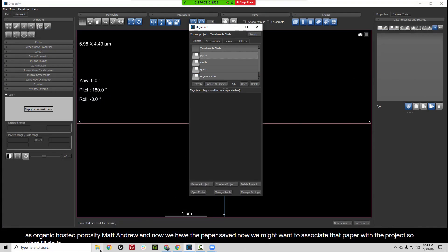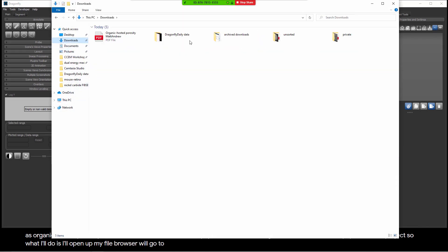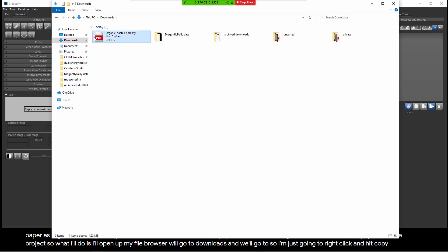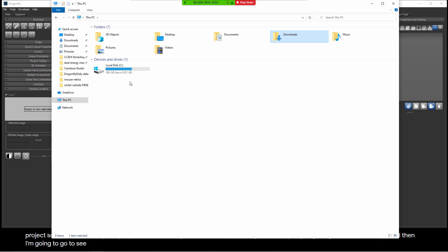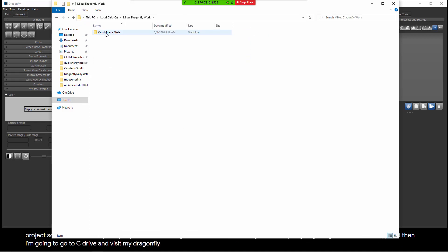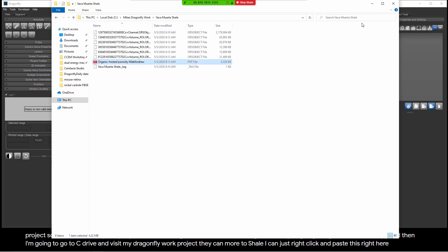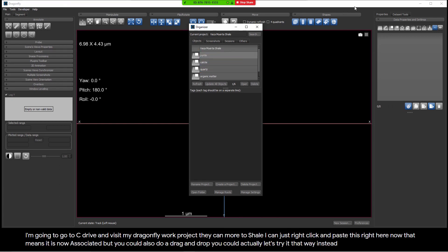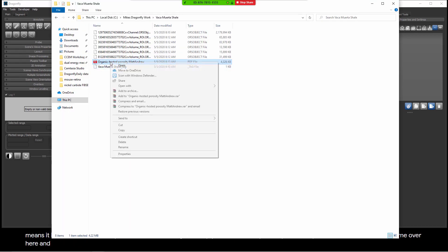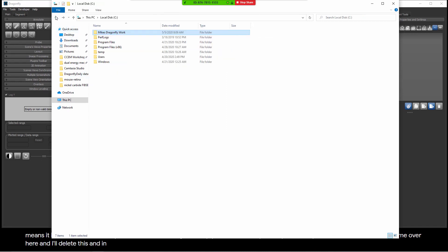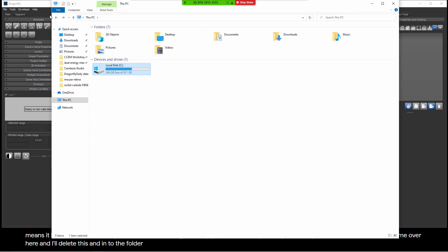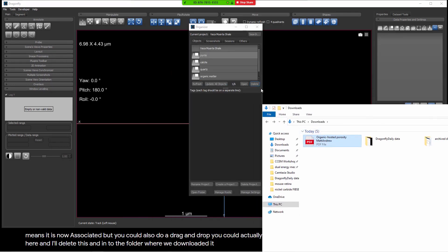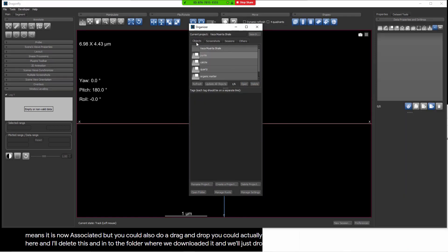Now we might want to associate that paper with the project. So what I'll do is I'll open up my file browser. We'll go to downloads. So I'm just going to right click and hit copy. And then I'm going to go to C drive and visit my Dragonfly work project. Vaca Muerta Shale, I can just right click and paste this right here. Now that means it is now associated, but you could also do a drag and drop. Let's try it that way instead. So what I'll do is I'll come over here and I'll delete this. And instead we'll go to the folder where we downloaded it. And we'll just drop it.